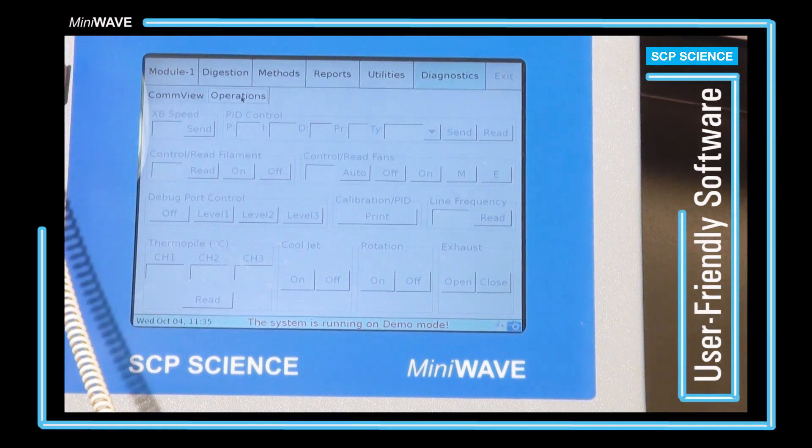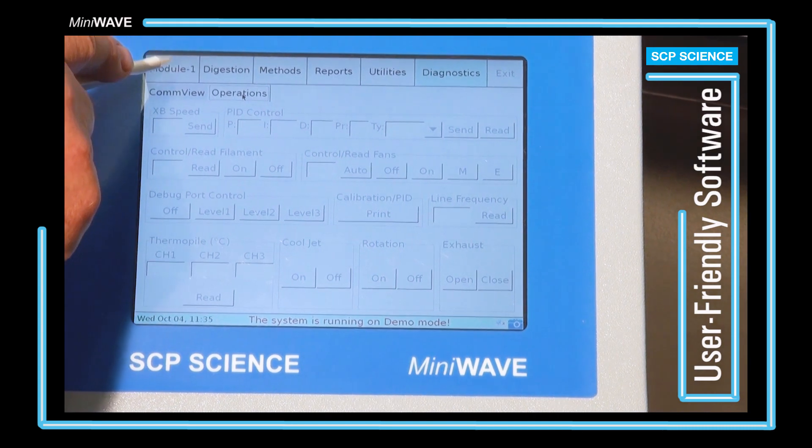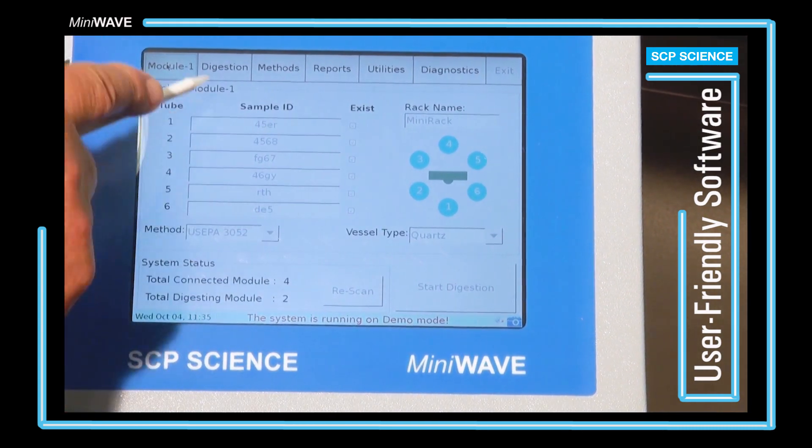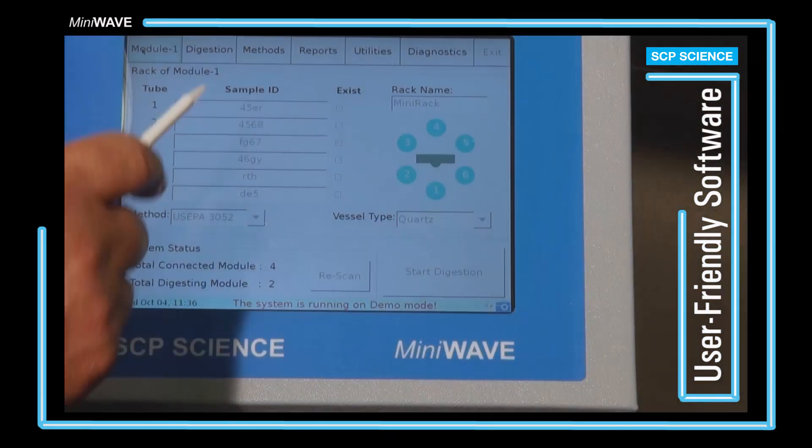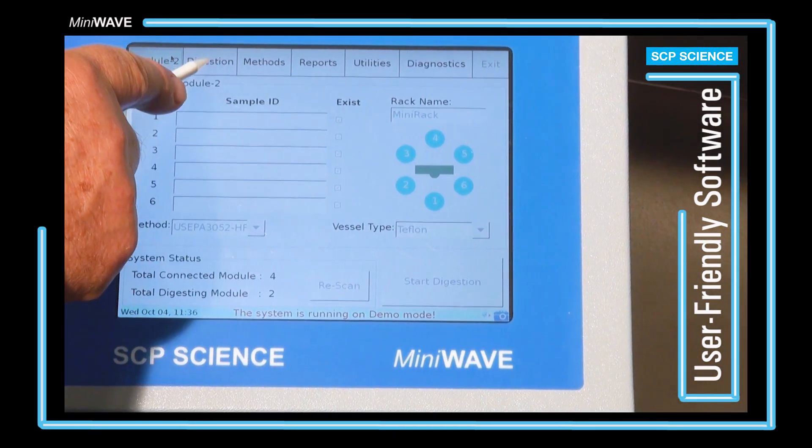The diagnostics tab is in place for service technicians. From any screen, the user can go back and look at the progress of their digestions and toggle between every module that they have running.